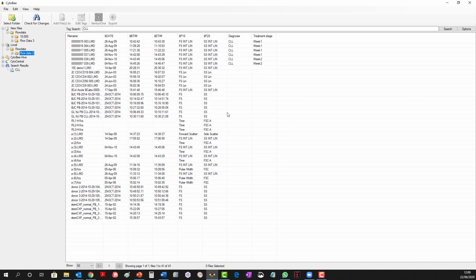And I'll now do some a little further away, and I'll make these week 3.